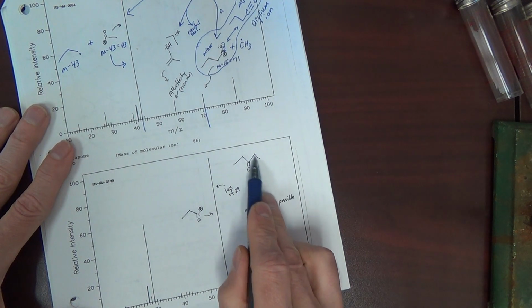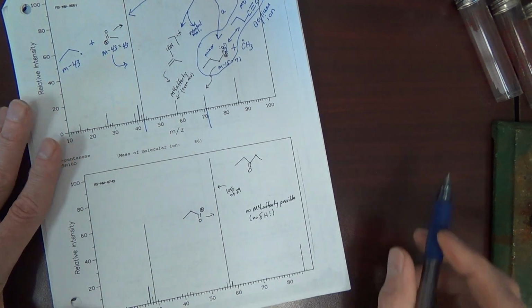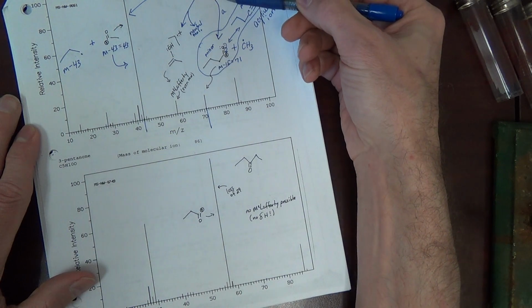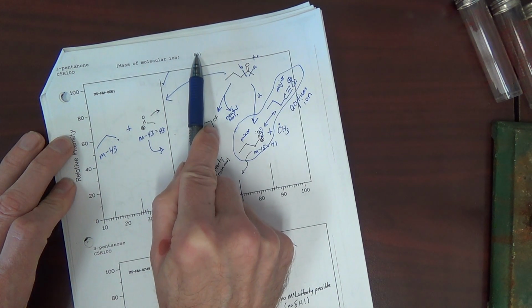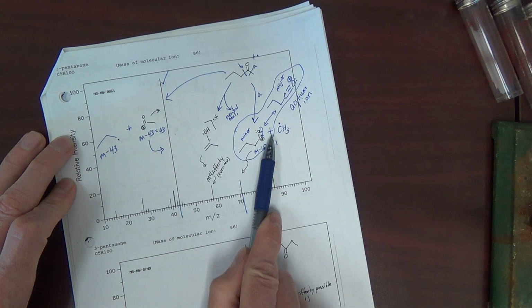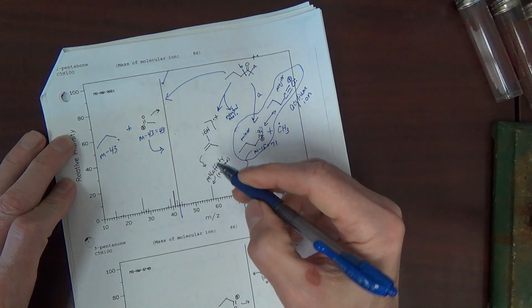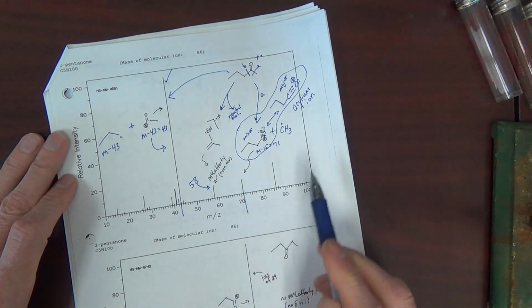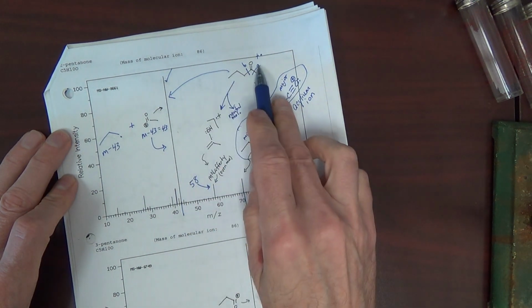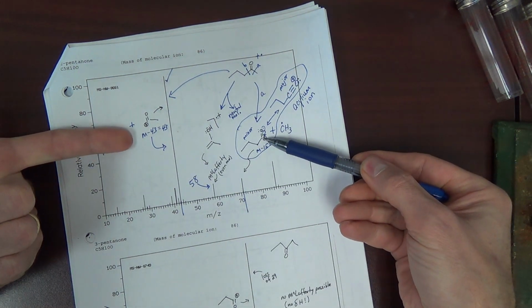Down here, there's not even a gamma carbon. Alpha, beta, either way. You cannot do McLafferty on this compound. Okay. One last thing about McLafferty. Note that there's no nitrogen. Molecular weight is even. Ions are odd. But note that the McLafferty adduct or product after the cleavage is 58. Okay, it's even, just like the original radical cation. Even, where your plain cations that are formed are odd.